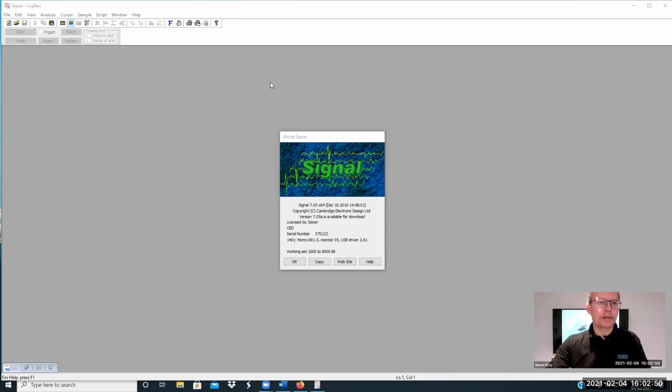Okay, so let's get started with Signal itself here, and as you can see on the splash screen, I'm running Signal version 705. Now, I did attempt a little earlier to get a 705A downloaded, but it was causing me a little bit of a problem with this new machine that I've got. Some of you who attended on Tuesday might remember that the machine froze, so I've decided to go for a brand new clean machine. But while we're here, in the splash window, you'll notice that it does tell us that 705A is available for download.